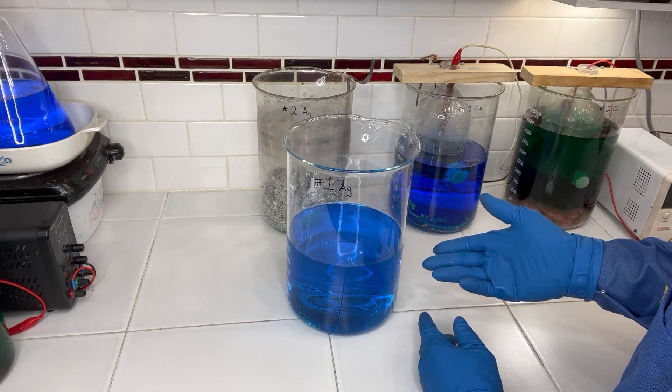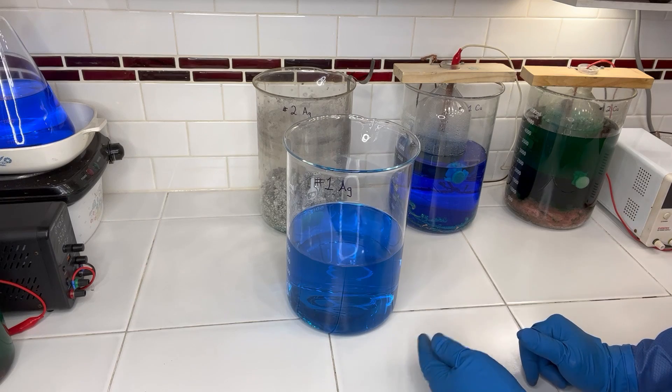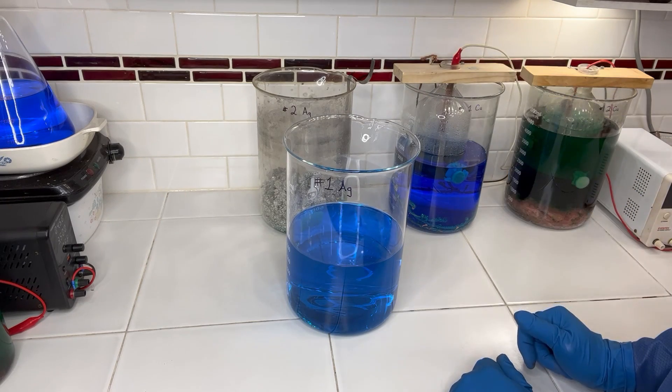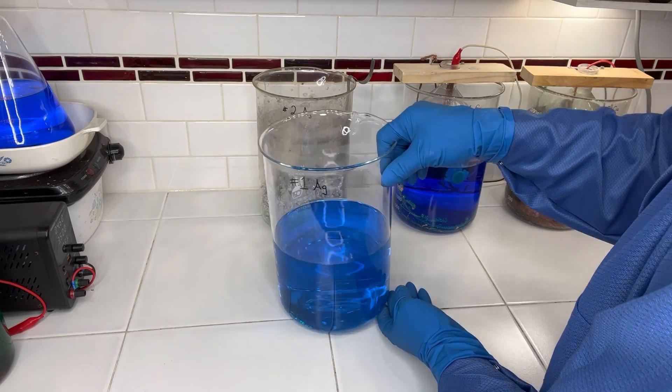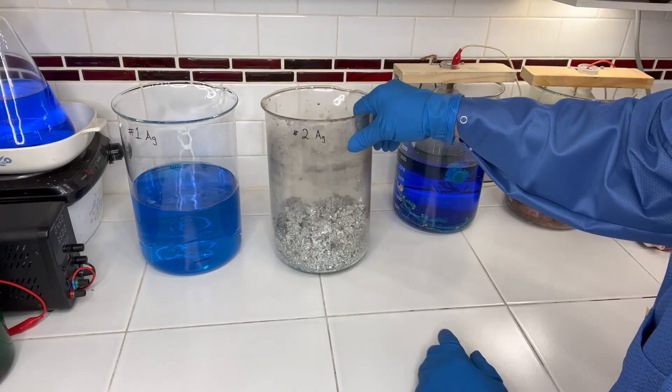This electrolyte will get filtered and we'll just reuse it. This definitely is not too dark to be reused back in the number two cell once we get that set up. We'll set that aside for now and let's take a look at our crystals.